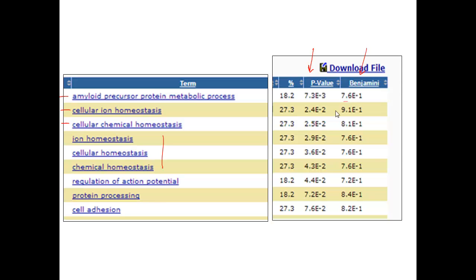On the one hand, you wish that the list of genes you were given would produce valuable insight. In this case, although there are some suggestions, the corrected p-values are telling us that the databases are not aware of common functionality of the genes we submitted which is statistically overrepresented in our set of genes.